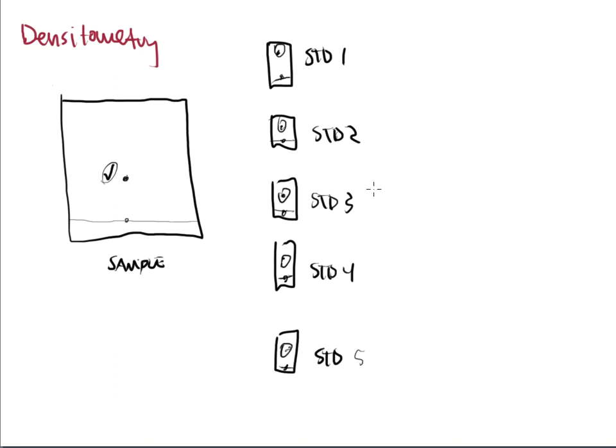And if I go up in concentration and I use some type of indicator on those spots, then my spots will become darker. This is the same concept that happens in UV spectroscopy, and it actually works most of the time with a UV lamp. Believe it or not, that's what we use. So we're blending chromatography in with spectroscopy and wrapping it into one concept.